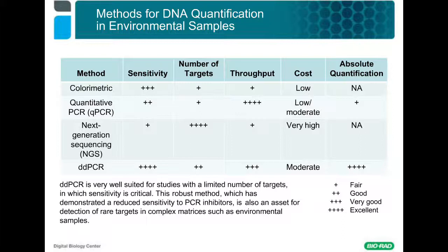They can then be plated onto agarose plates or other types of substrates, and using a colorimetric reaction, you can identify the type of pathogen that was initially present in the sample.